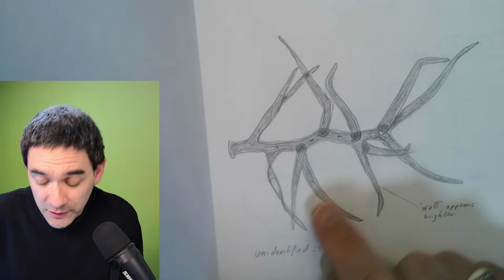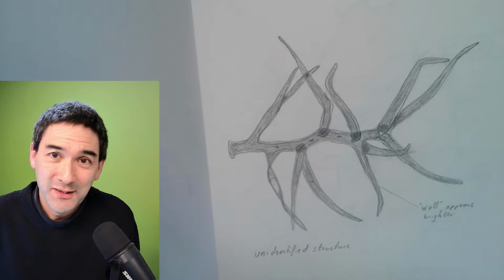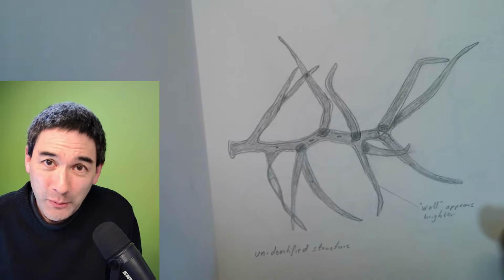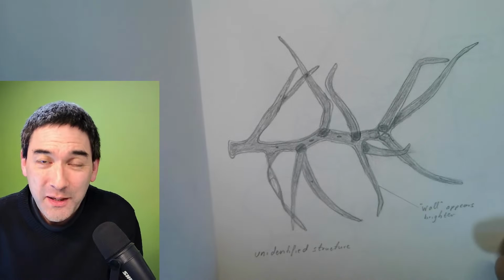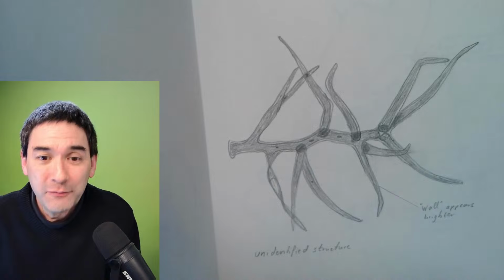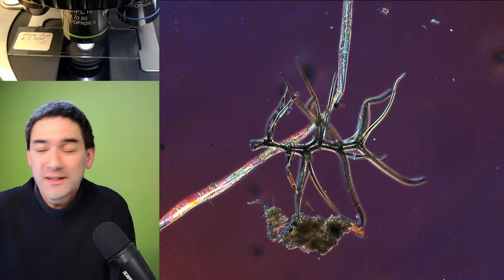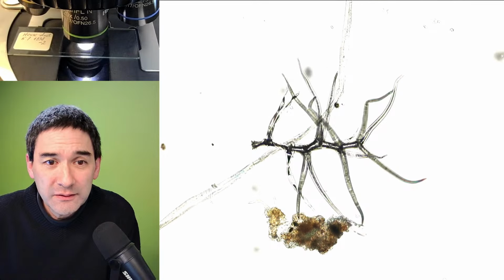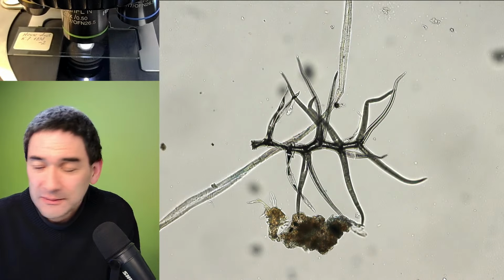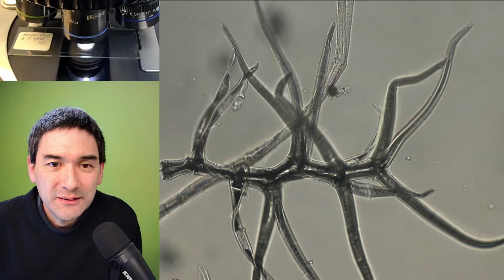Sometimes they break off quite easily. And yeah, I have to say again the German term Sternhaar, which means nothing but a star hair. Again, a very descriptive term. Yeah, so that's how it looks like in bright field. So that's one of the nice things.